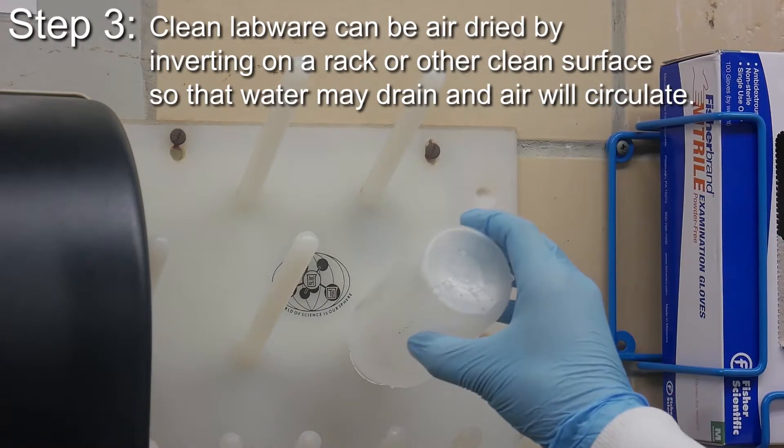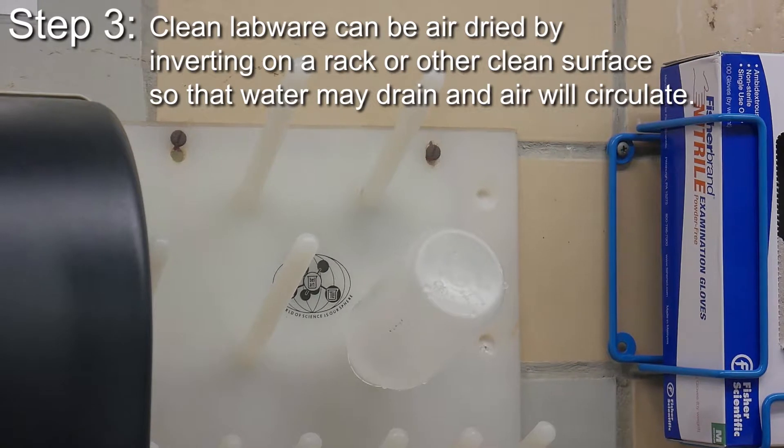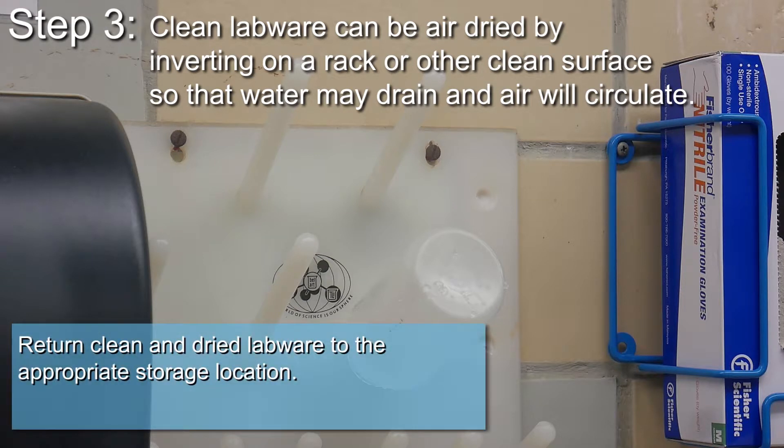Clean labware can be air dried by inverting on a rack or other clean surface so that water may drain and air will circulate. Return clean and dried labware to the appropriate storage location.